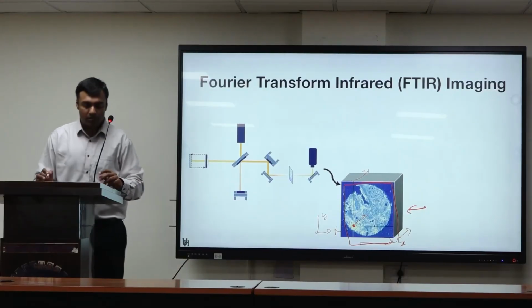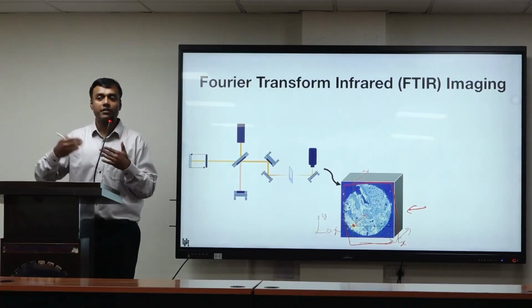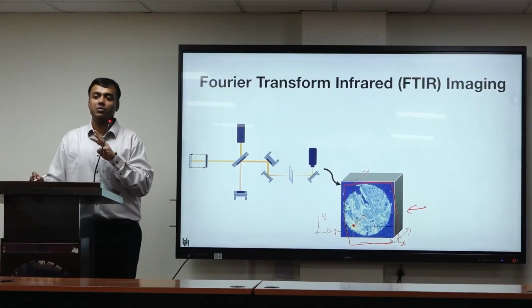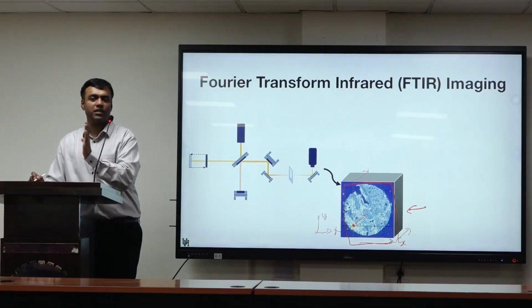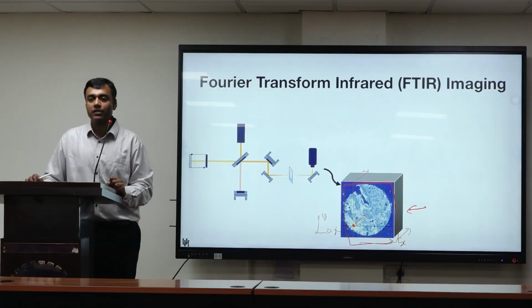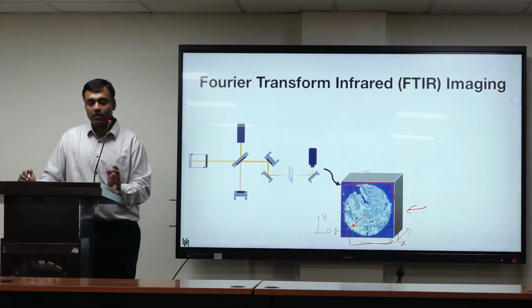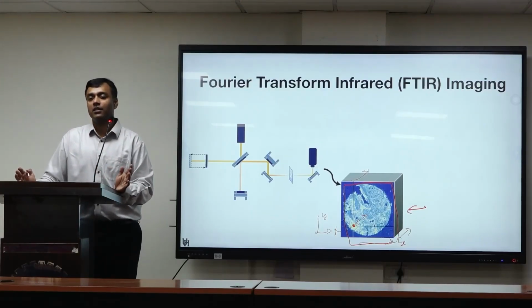And you can measure, in the infrared, up to even 1600 wavelengths. So imagine visible light, right? You have red, green, and blue, three colors. Typically, that's what you get in most color images. Red, green, blue are enough to get images in the visible. But in the infrared, because there is such a large number of wavelengths, you can get up to 1,600 separate wavelengths, and in FTIR, they're commonly measured.